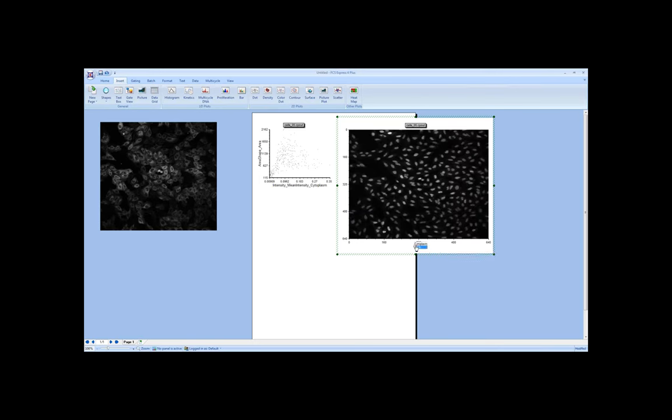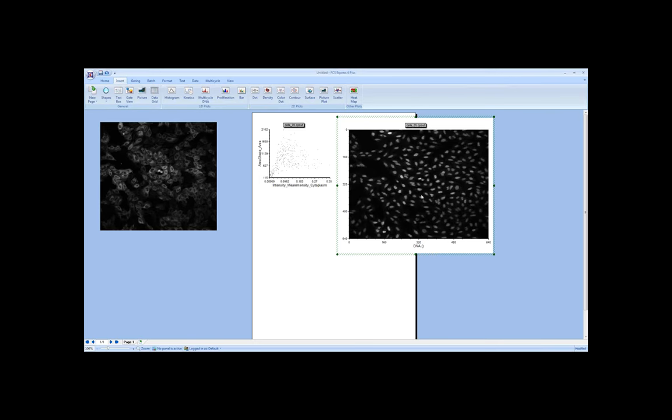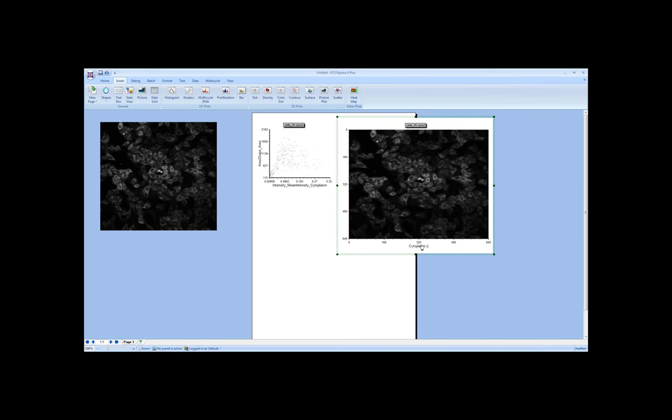So in this particular experiment, we only took 2 images, a cytoplasmic image and the DNA DAPI stain image. As you increase the number of channels, you'll certainly find all of your channels in here. As you'll see in Dragan's data later, he has kind of perfected the technique of working with many, many channels worth of data. But in this case, we're going to leave this cytoplasmic.